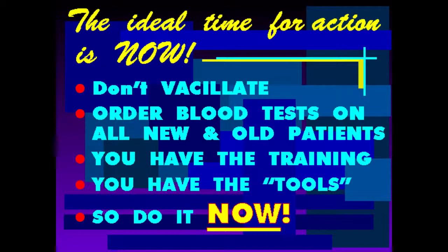This session has provided you with a practical method of assessing the pathological, functional, and nutritional elements in human blood. Although there is a wealth of knowledge and much detail in these pages and slide images, you can easily learn by merely doing. For it is only by doing that we are able to develop a skillful and superb ability to read the telltale signs of the blood. It will be slow at first, but with perseverance you will find that speed will soon follow accuracy.